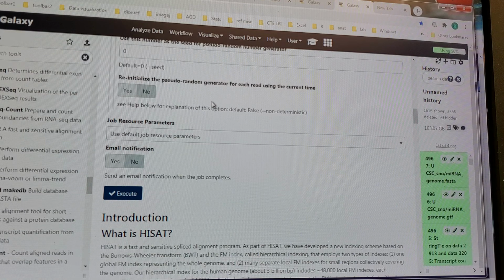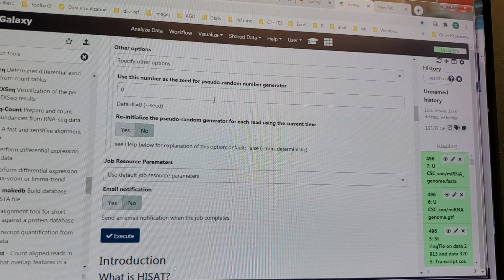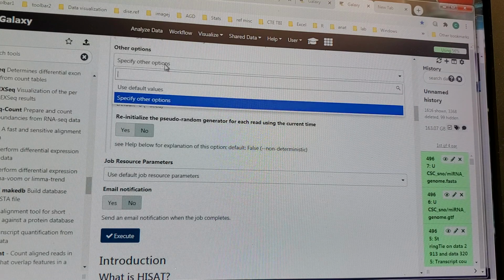So if you thought that random number generation was going to be a problem, and the way you would think that is if you're a super math nerd and you've worked it out, or if you read a paper where people suggest that it could be a problem, then you would want to play with these. We don't want to play with these right now. I would like to run one with and without this just to see if it makes a difference, but I'm not going to put you through that.